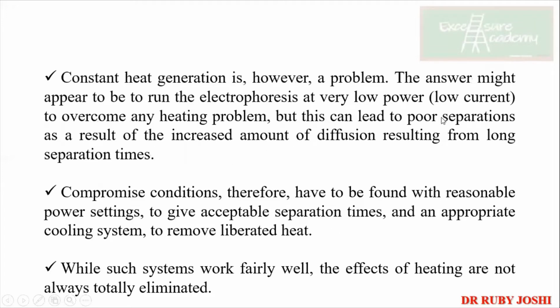So what is the answer then? So हम क्या करेंगे, एक कांस्टेंट में जाएंगे. अगर फॉर एग्जांपल इफ एनीवन इज सेइंग कि आप उसको स्लो में चलाओ, इलेक्ट्रोफोरेसिस को स्लो में चलाओ, लाइक फॉर एग्जांपल 40 वोल्टेज या 50 वोल्टेज में चलाओ, सो व्हाट विल हैपन, just because it is so slow, again there will be increase in the diffusion which will result in the long separation time. So इसलिए एक proper तरीके से आपने एक fixed voltage आपको use करना है, ठीक है?